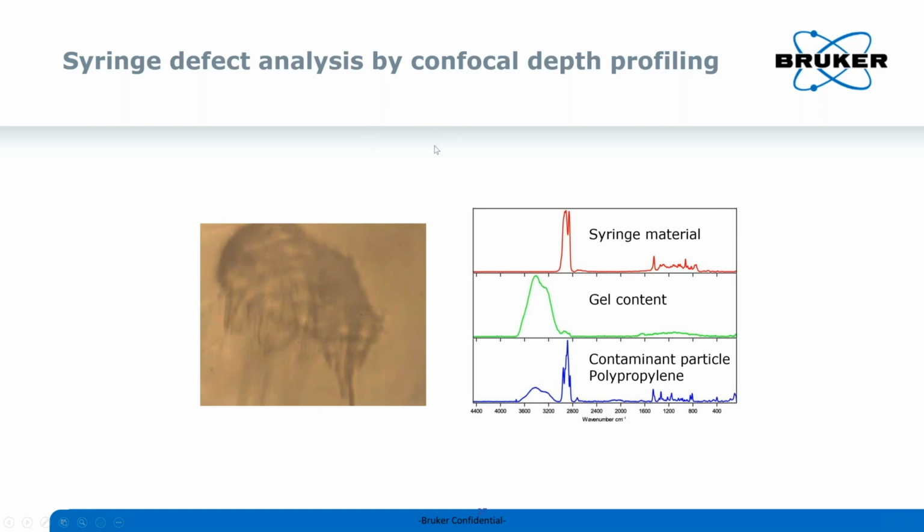So in this case, you actually don't need a high resolution objective to do this, where you're trying to get micron resolution like I showed in the previous example. Now you'll just use a 10x objective, and it works great.